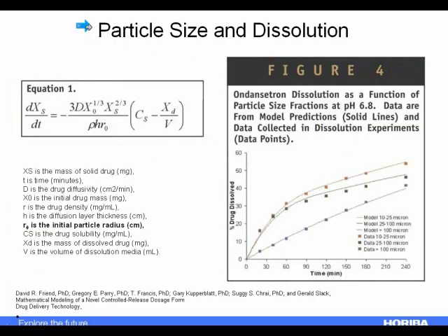Not only in the pharmaceutical industry, but in many powders, for instance, if it's going to be added to a liquid and then it's going to dissolve, particle size can be very important.